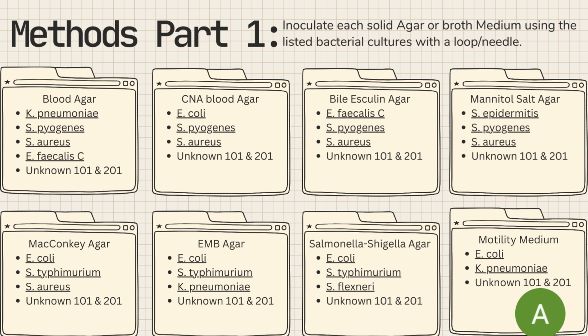In this experiment, each solid agar or medium broth was aseptically inoculated using the listed corresponding bacterial cultures with a loop or needle. Additionally, each plate was labeled according to its inoculated bacteria and corresponding medium before being sealed and incubated.